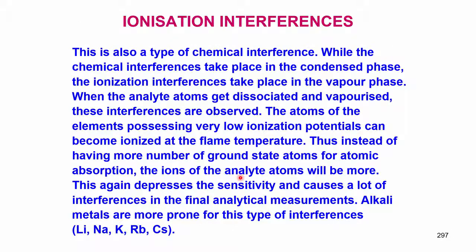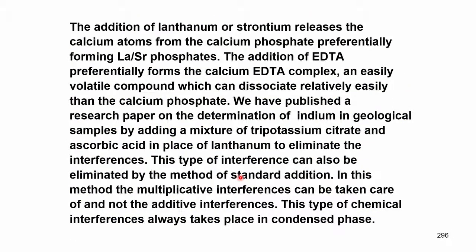So, the addition of lanthanum or strontium, that is also another releasing agent, releases the calcium atoms from the calcium phosphate, preferably forming lanthanum and strontium phosphates. Addition of EDTA forms calcium EDTA complex, and that is volatile. We have published a research paper on the determination of indium in geological samples by adding a mixture of tripotassium citrate and ascorbic acid in place of lanthanum, because lanthanum is a very costly element. So, this combination also we have tried.